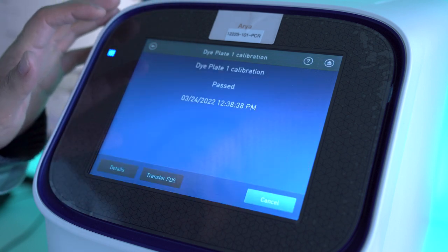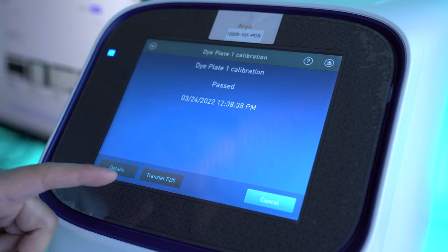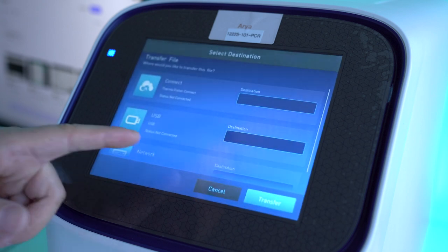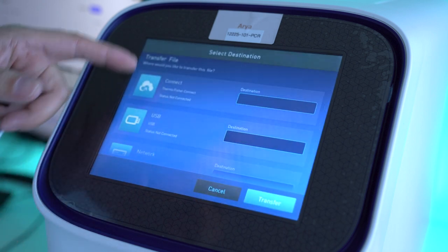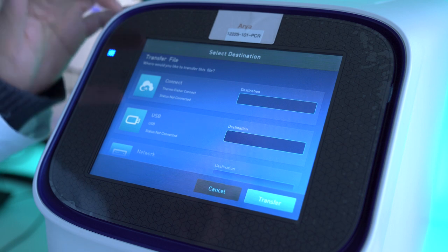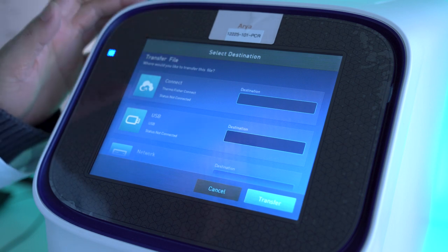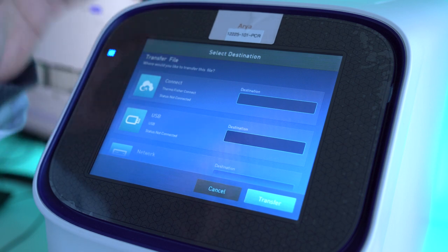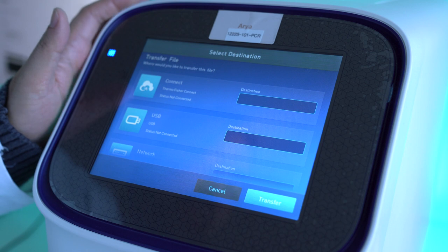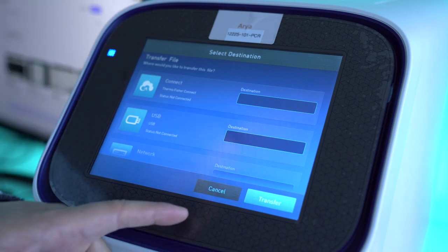Another thing you can do to make it much easier to view is click Transfer EDS. If you have a USB stick or the ThermoConnect, you can put the data onto your computer and view it in the desktop software. That's a much better way to view the data.